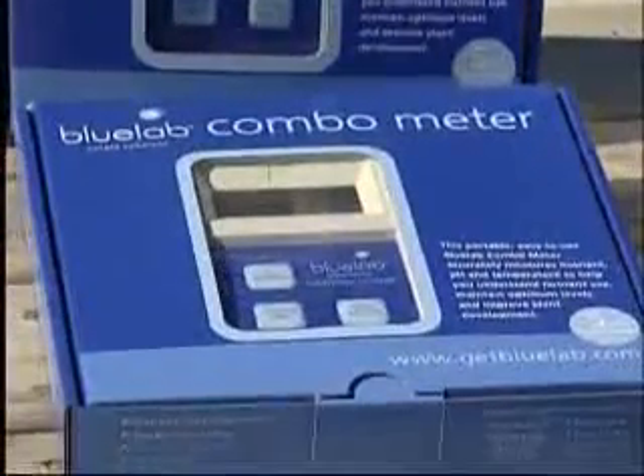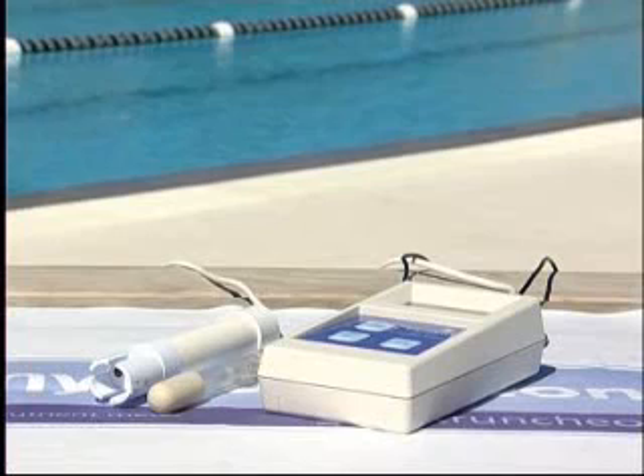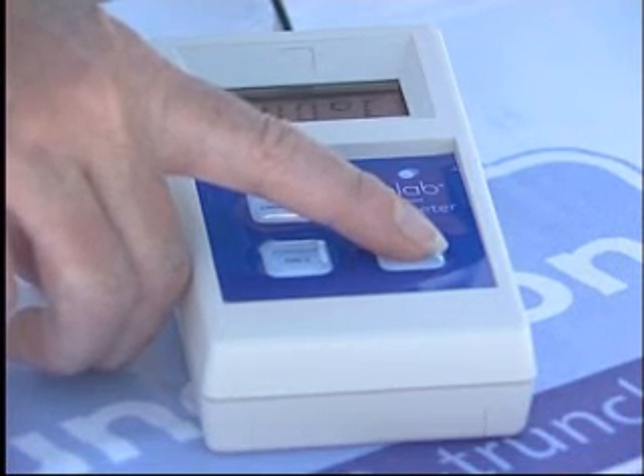The Bluelab combometer is a testament to simplicity, yet highly practical, robust and efficient. The combometer measures the pH, conductivity and temperature levels of a solution. It has changeable scales and degrees of temperature, all at the push of a button.